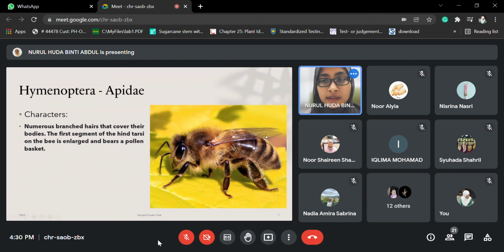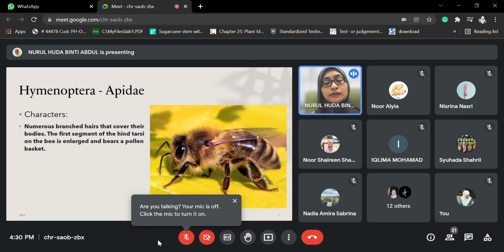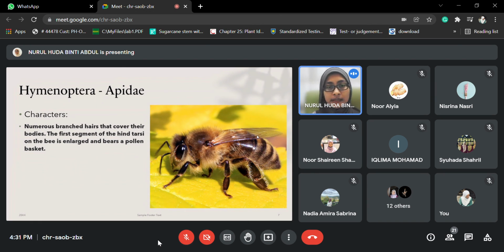Sometimes the venation, the shape of the venation, the shape of the cells that enclose the venation, is also used for identification purposes. But for a large group like Apidae, which is a family, we do not use the venation or shape of cells for identification. If you want to go into more detail for genus or specific species, then you have to use it for identification purposes.